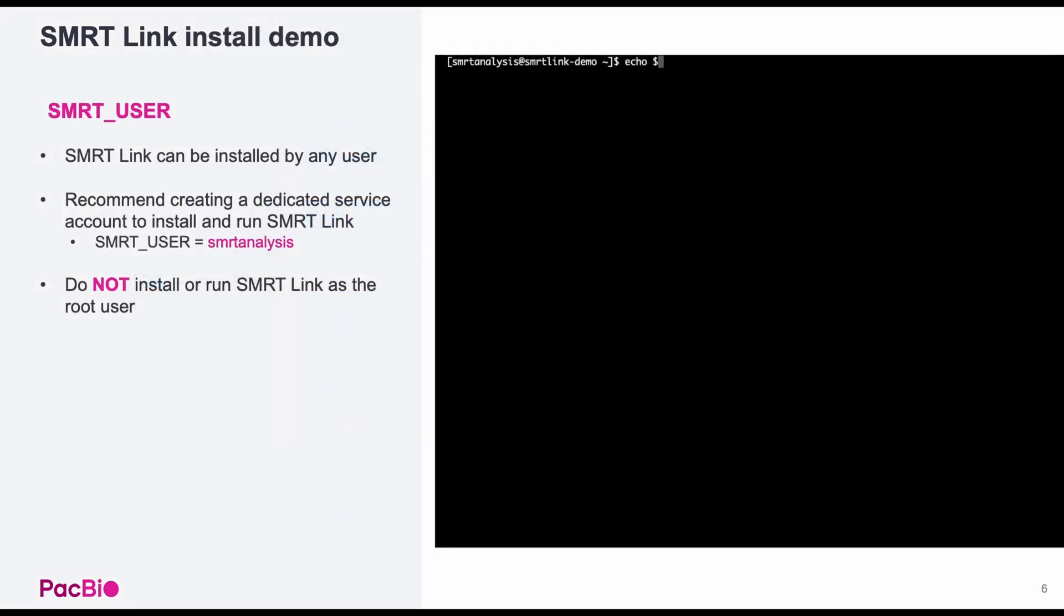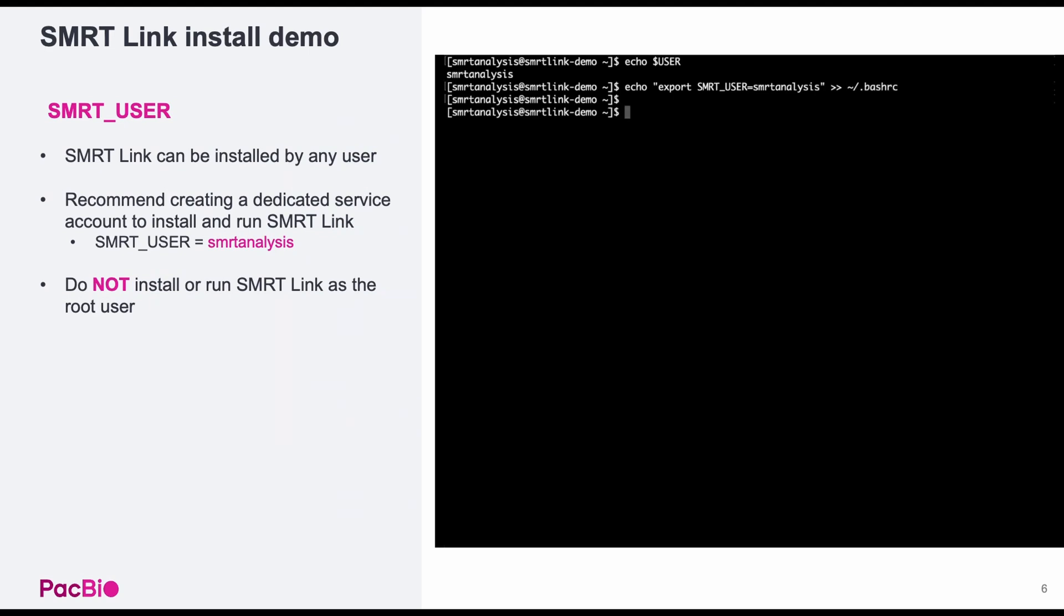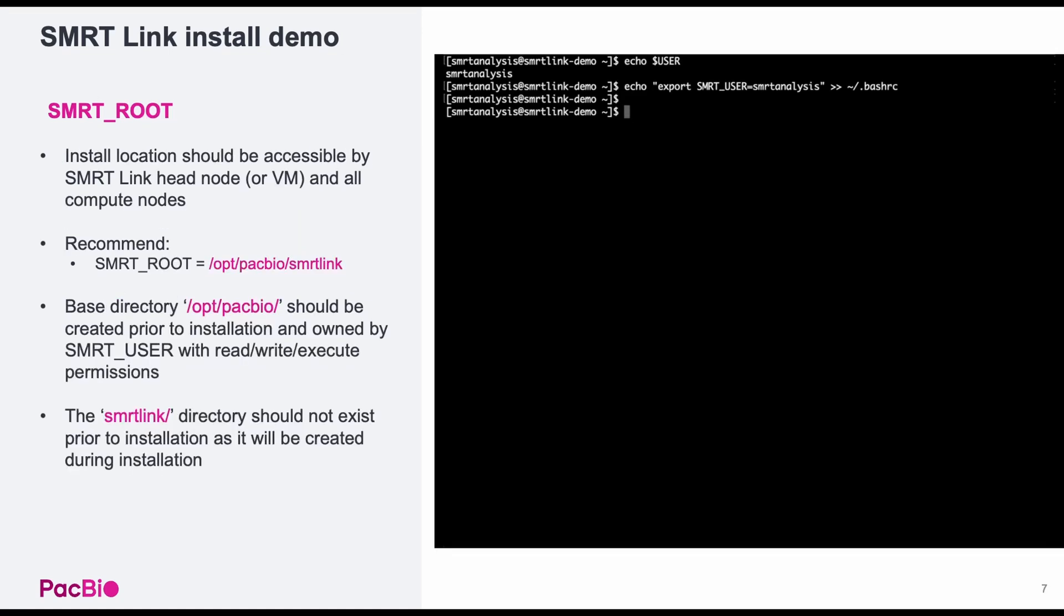To start, you should note the user installing SmartLink. While SmartLink can be installed by any user, we recommend installing SmartLink as a dedicated service account. We recommend the username SmartAnalysis and to set a variable named SmartUser. Do not install SmartLink as the root user.